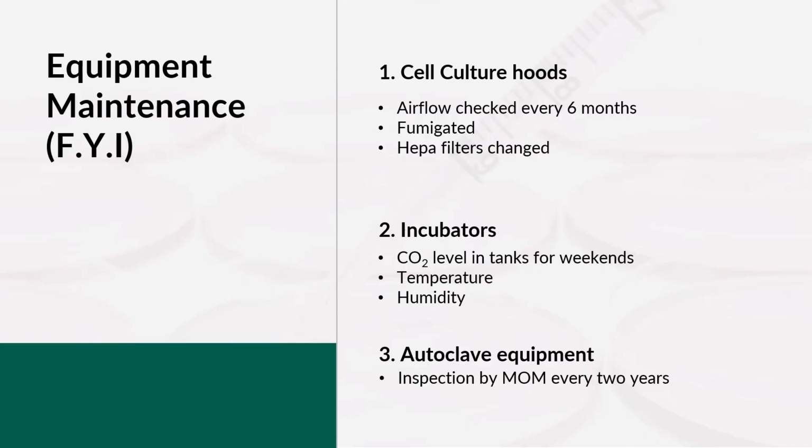Okay, and with a regular and frequent preventive maintenance schedule in place to ensure that the tray is emptied, thoroughly cleaned and refilled, as it can potentially be a source of bacterial and fungal contamination. Therefore, it is important that the tray can be easily accessed and cleaned. You can clean it with a low concentration of a disinfectant detergent.